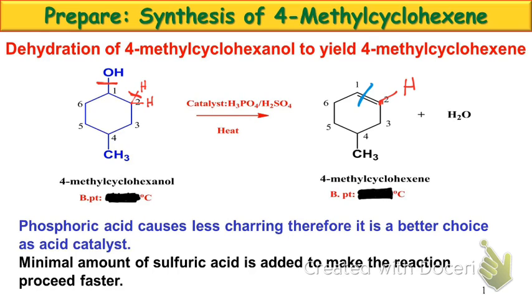What's that? Reflux allows us to add heat. It doesn't isolate. Distillation. When does distillation work? What does distillation separate? Try again. Liquids from liquids, and it separates them based on their boiling points. Okay? Let's throw all the options out on the table, and we'll see what happens.